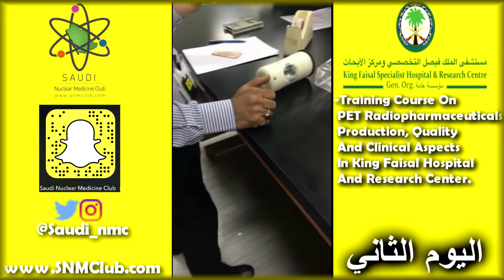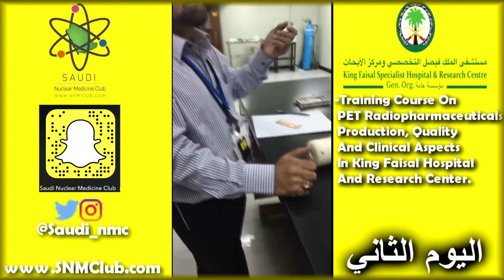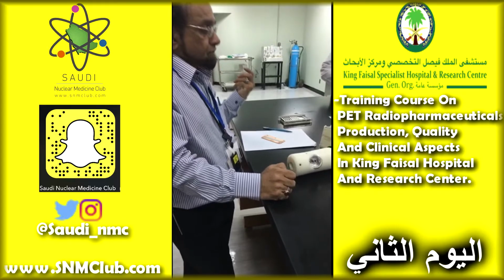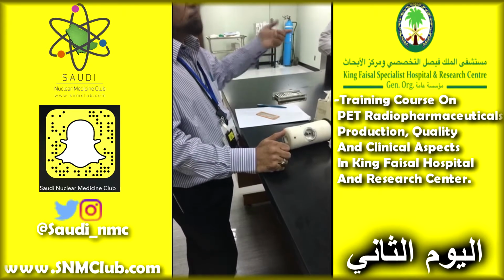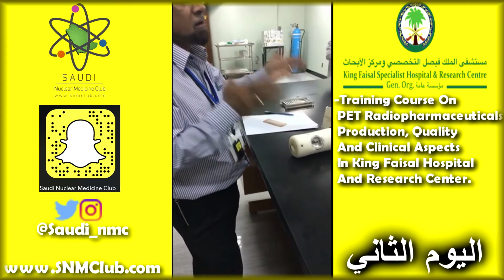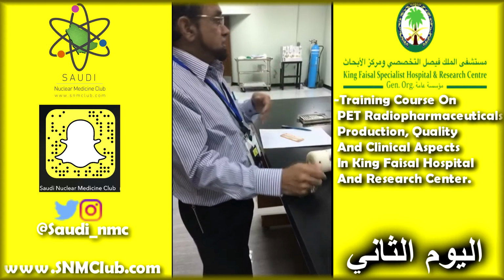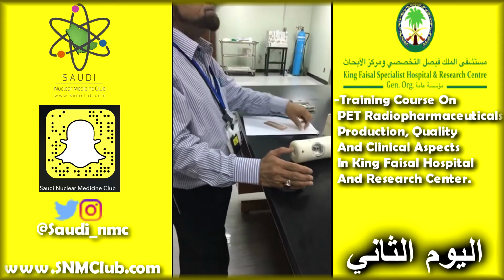That's radiochemical bulk. You send a sample. If you have 123, there should be less than 5% of 124, something like that. Or maybe less than 5% 124 with the expiry period. And then if everything is passing pH or concentration, whatever the specific activity.